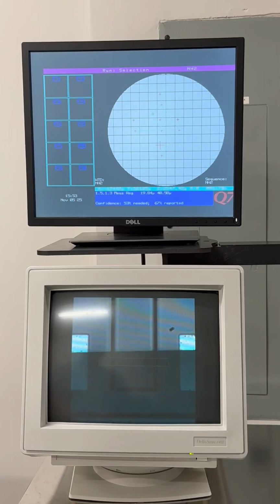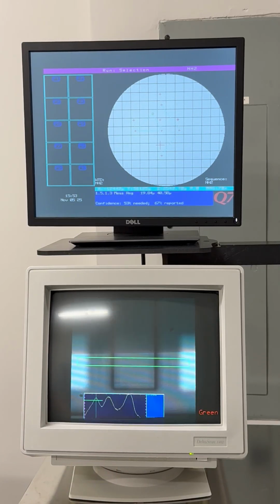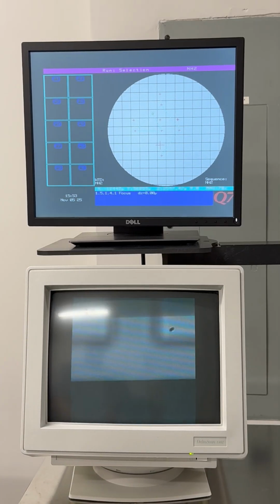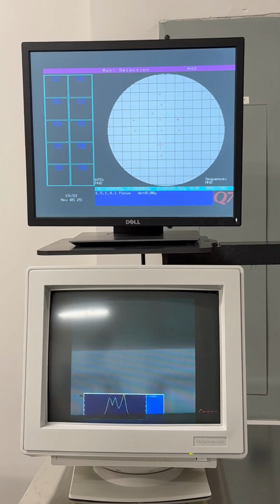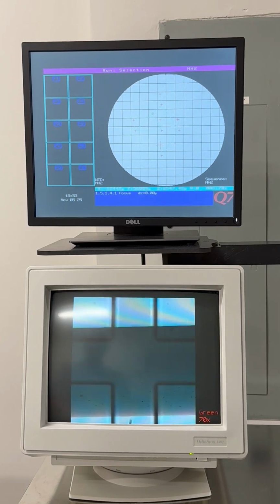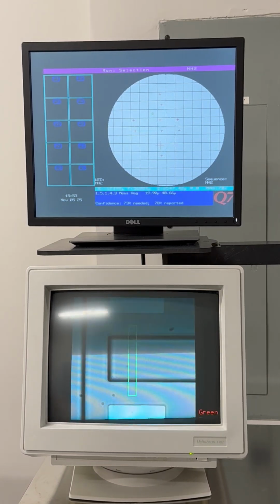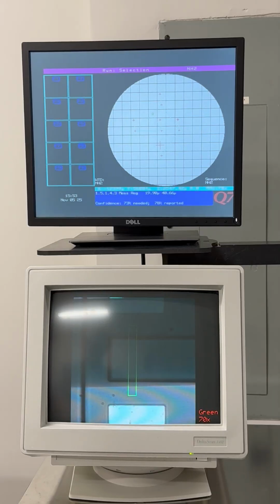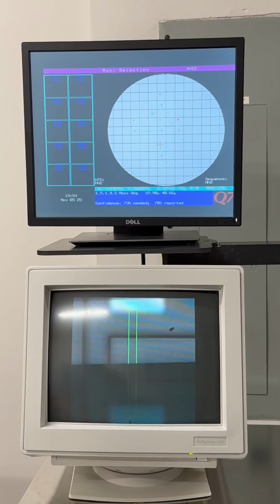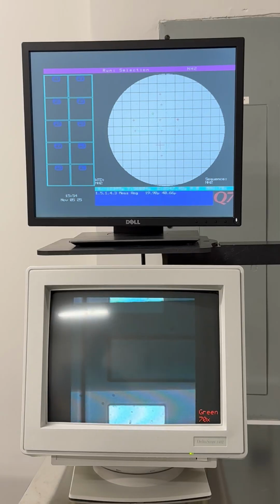The hunting that it's doing at the moment is because the structure of this is slightly larger, but you'll notice that it goes around, it checks to make sure that there's not a better site, and then it will move back and it'll find the position that we want in order to put the gates up afterwards. So we call that a blind step. Having done the pattern rec, we're not measuring that particular point, we're just using it for pattern rec, and then we move over with a blind step, as we call it, which then goes to what we want to measure.